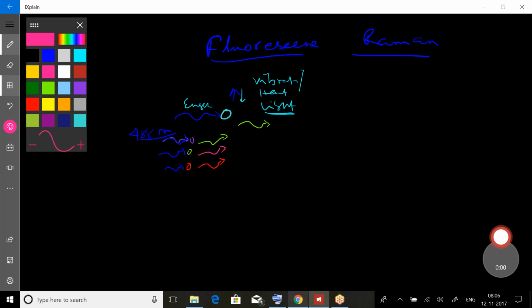That is how, with flow cytometry, we can measure multiple different fluorescence emissions, and on the basis of the fluorescence emission we get to know the different properties, or parameters, of the cell. I'll talk a little more. These fluorescent molecules, or fluorochromes, have a distinct property: they have something called an excitation spectrum and an emission spectrum.